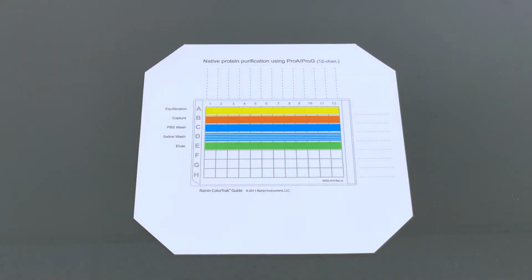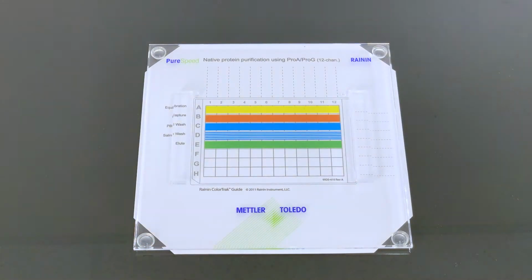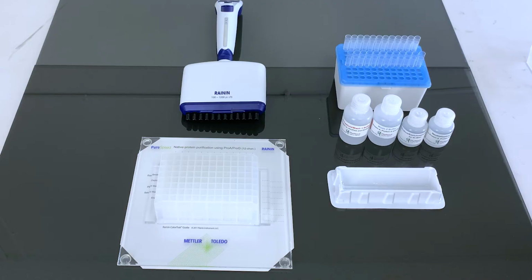Start assembling the base by placing the color track guide as a template on your table. Then place the platform base on top of the guide. Slide the 96 well deep well plate into position on top of the guide along the rails.